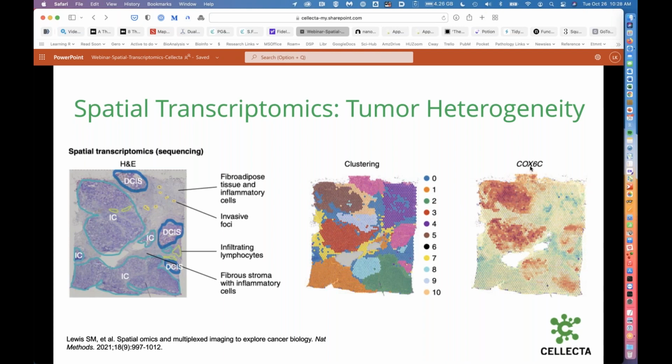Here's a cytochrome gene that is of some interest in cancer, breast cancer biology, which was analyzed throughout this grid. And you can see there's high and low and medium areas of expression, once again, including heterogeneity within apparently similar areas of tumor. And this is part of the promise of spatial transcriptomics, that is to say, to help us see through areas that may look similar histologically, but in fact have different biology going on with potential for different approaches to prognosis or therapeutics.